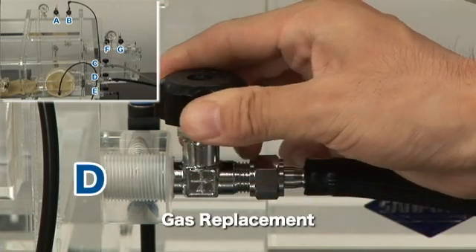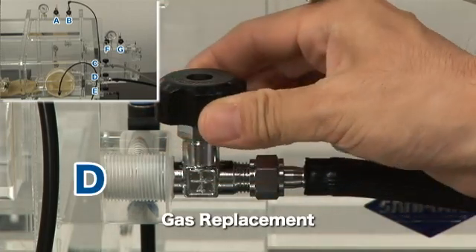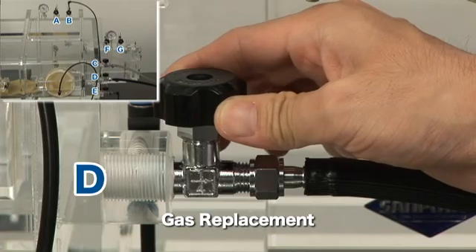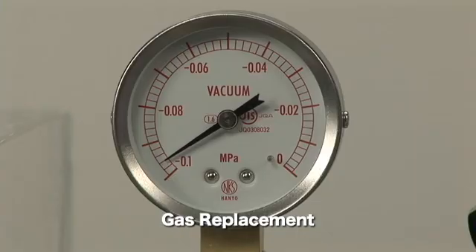In order not to create too much pressure, open the valve little by little and introduce gas slowly. Then, bring it back to atmospheric pressure.